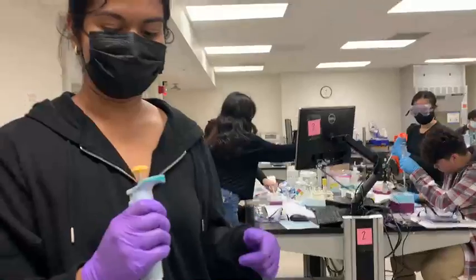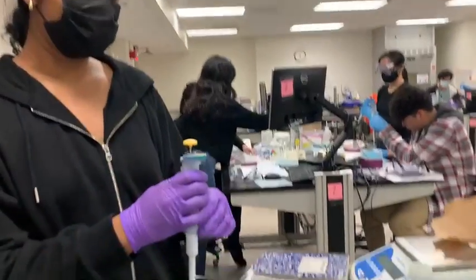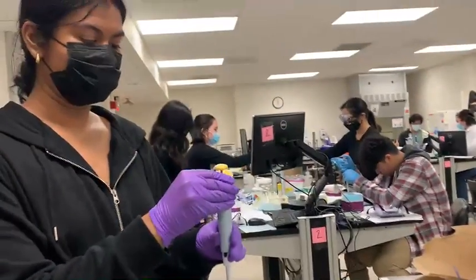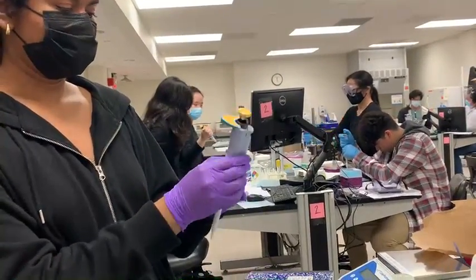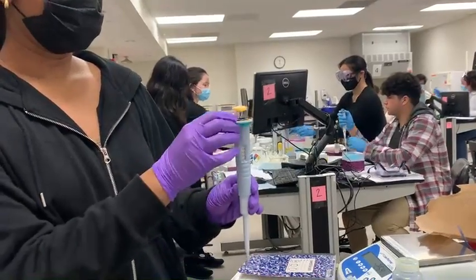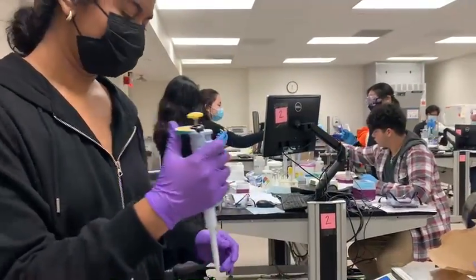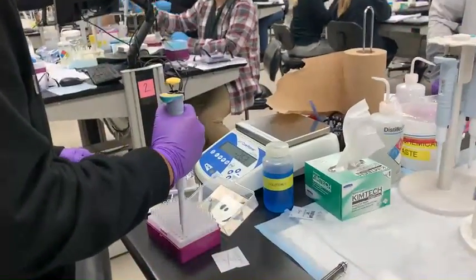I'm Rhea. I have the 2 to 20 microliter micropipette. I will be dispensing 11 microliters. First, you want to unlock and set it to the right volume — I'm already at 11. So you re-lock and get the correct tip.